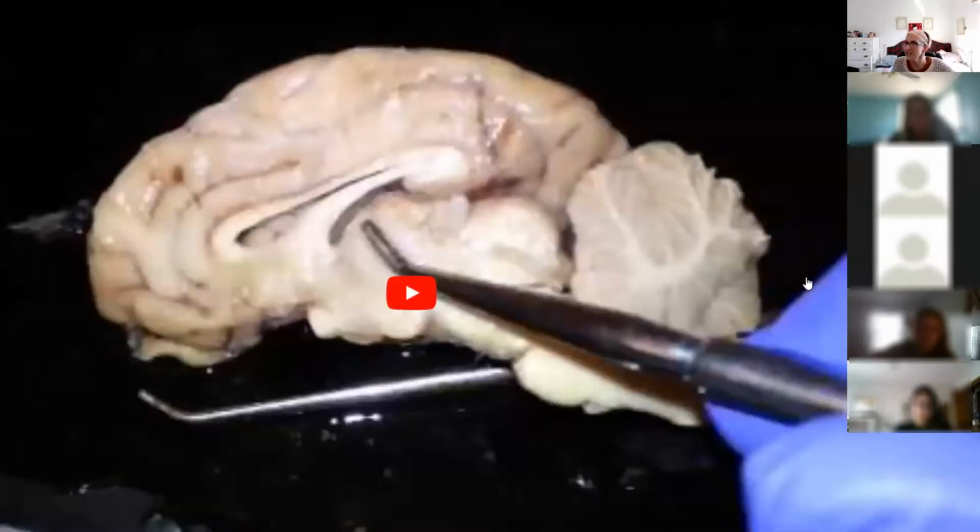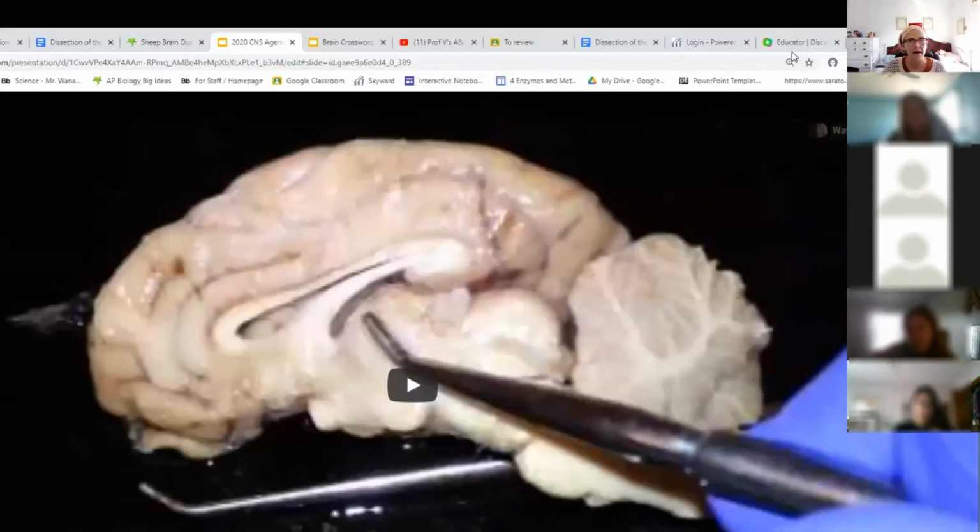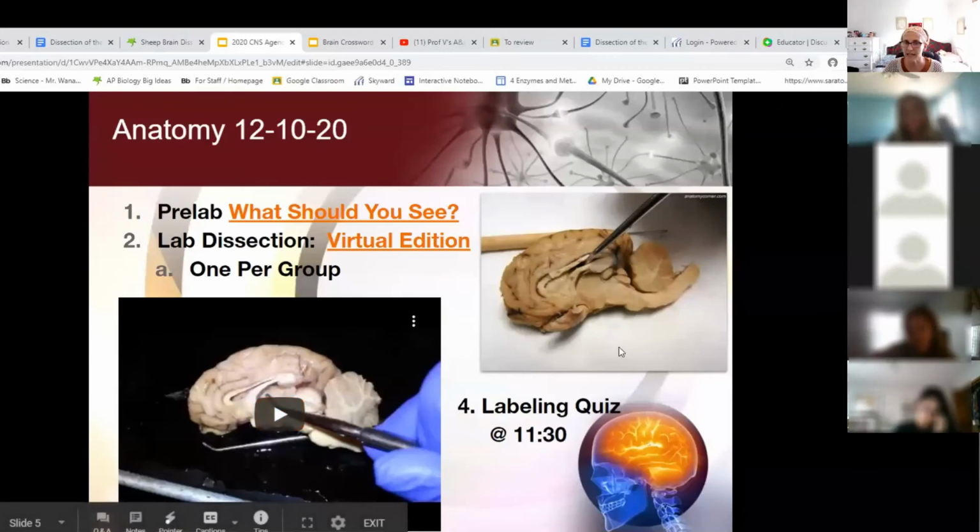Okay, she even wished you guys good luck next week on your quiz. Okay, so that's what the true dissection looks like. So do you guys have any questions on this?